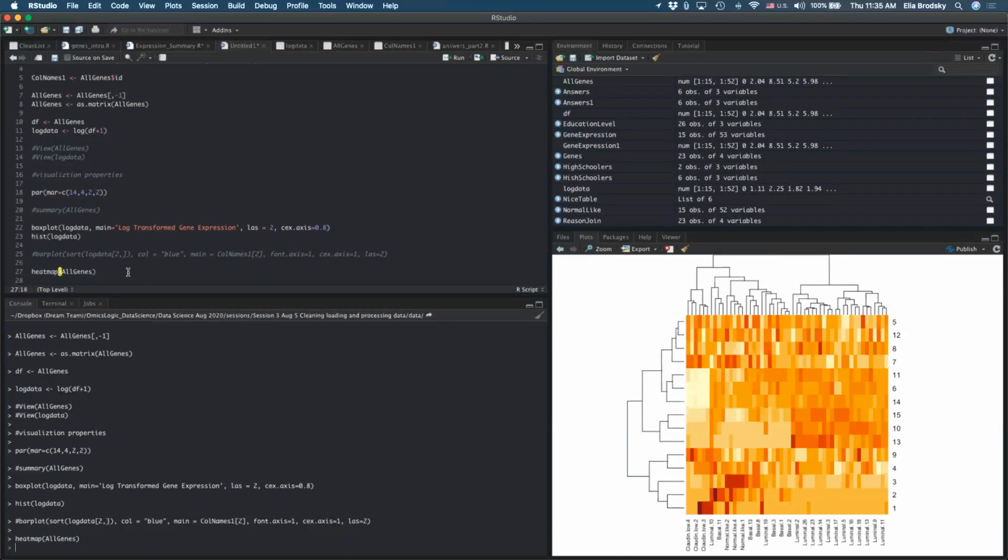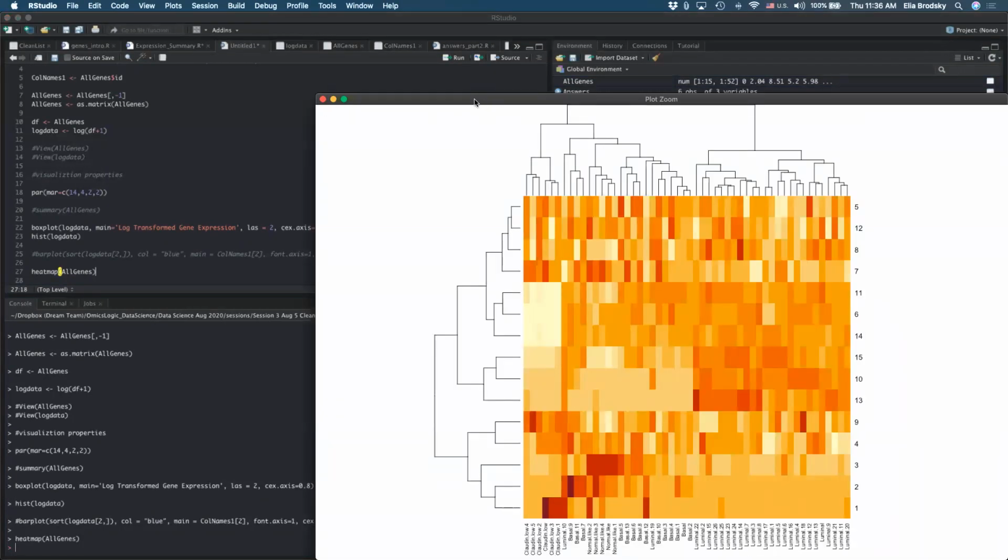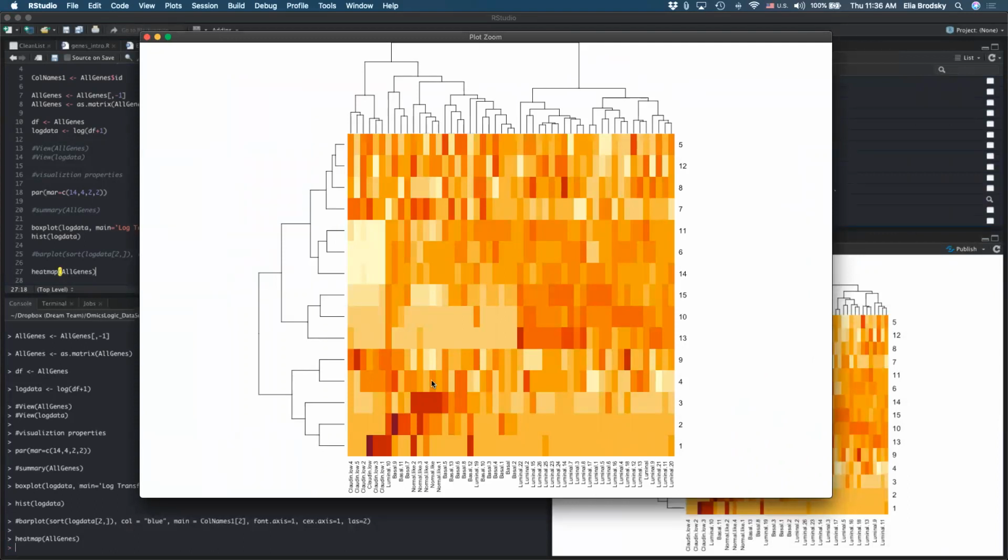So what does this heat map actually represent? The heat map represents, like a bar plot, the level of expression. The level of expression is color. The darker the color is, the higher the expression. It also organizes both our genes and our samples. This is organization of samples, this is organization of our genes, in such a way that it is easier to read the pattern. Just like we organized our genes in our bar plot, it organizes it.